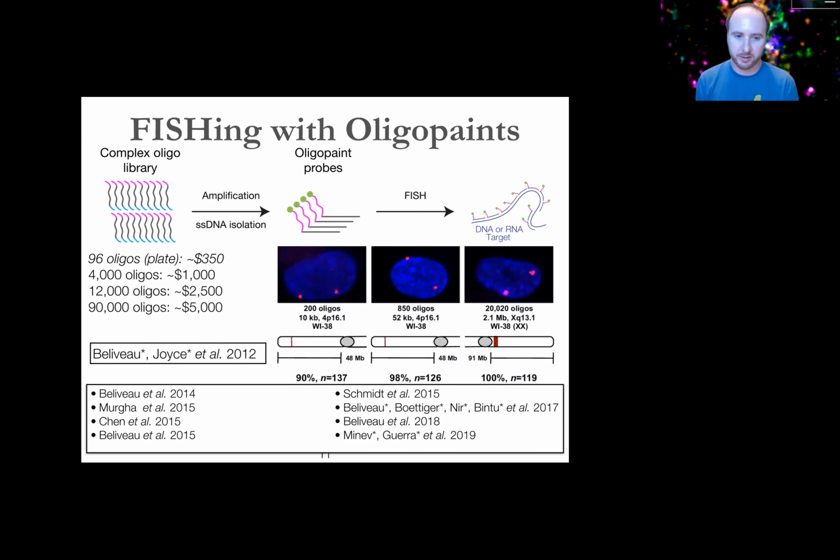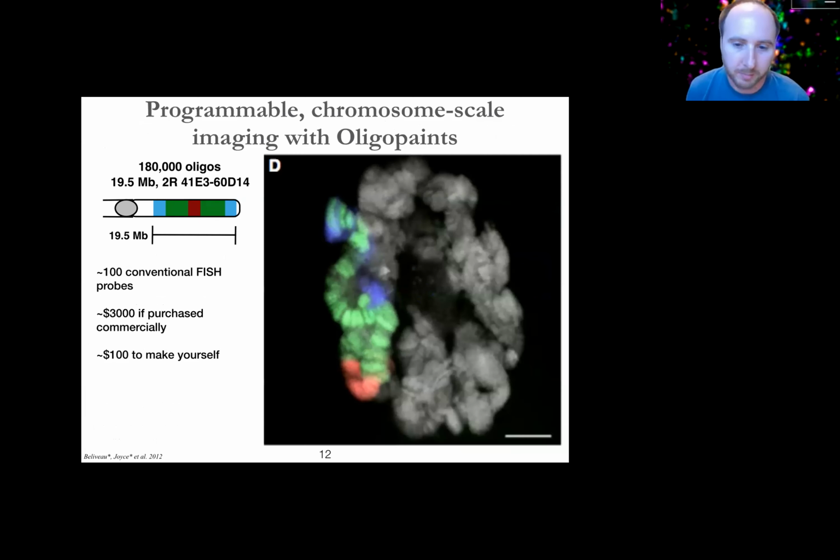So it's really satisfying as a developer who's involved heavily in making this technology way back when to see what it's out and doing in the world. I think this slide, besides just showing one of my favorite chromosome images that was taken by Eric Joyce, provides a nice example of what you can get from using this kind of technology compared to the more standard FISH approaches.